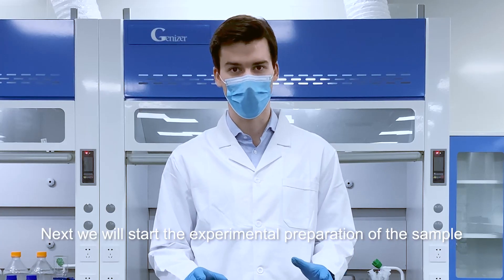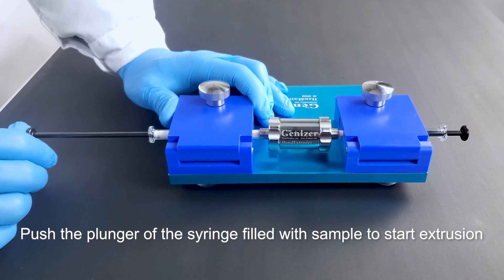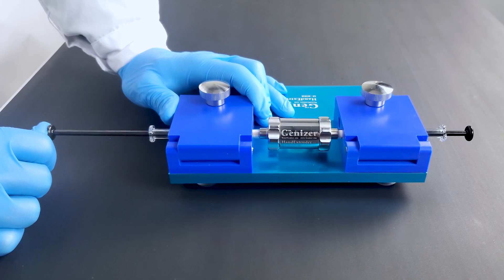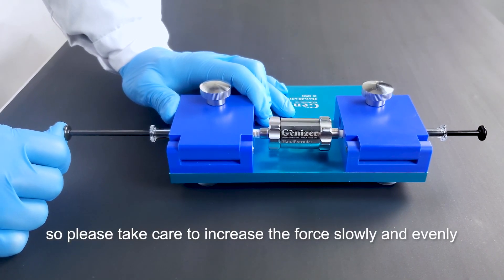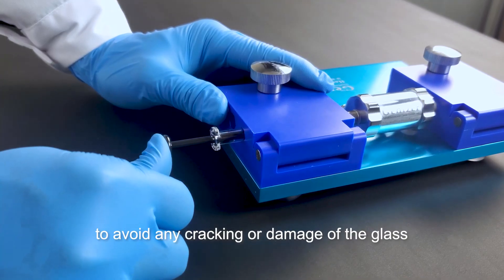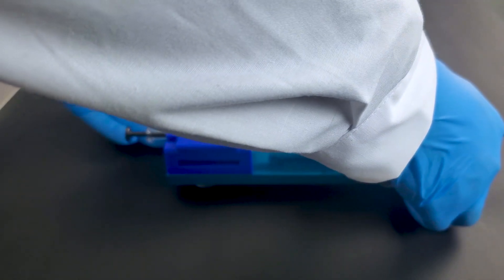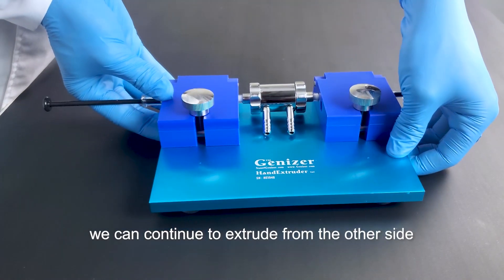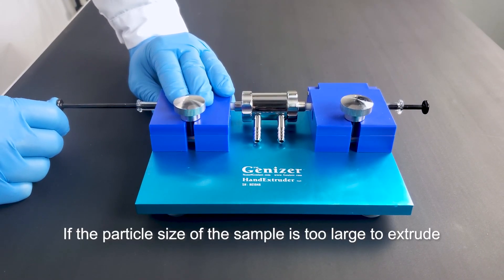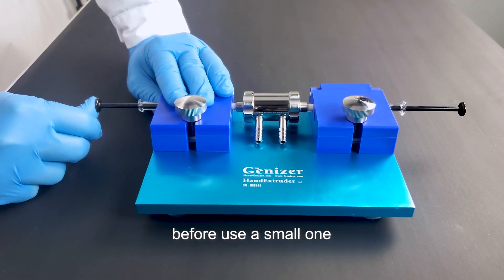Next, we'll start the experimental preparation of the sample. Push the plunger of the syringe filled with the sample to start extrusion. The housing of the gas-tight syringe is made of glass, so please take care to increase the force slowly and evenly, and keep the direction of force straight along the syringe to avoid any cracking or damage of the glass. After completing one extrusion, we can continue to extrude from the other side. If the particle size of the sample is too large to extrude, it is recommended to extrude with a membrane with large pore size before using a small one.